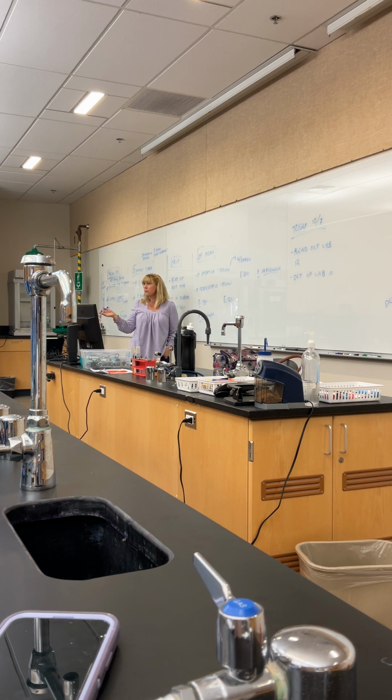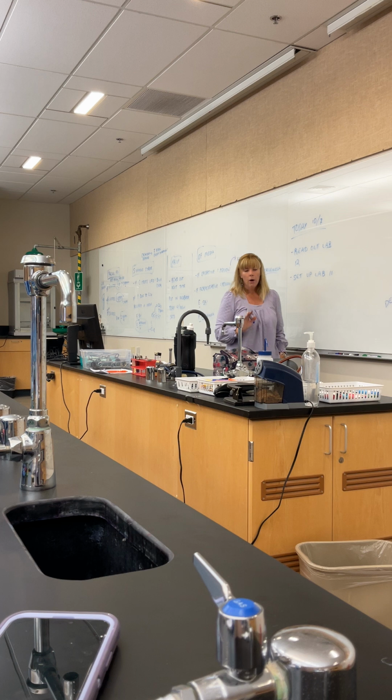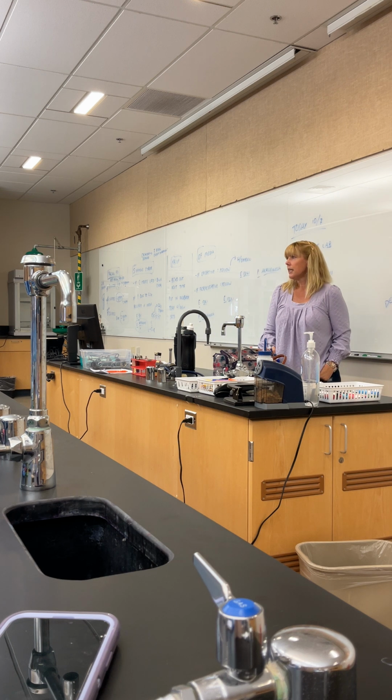And that makes sense. Where does E. coli live in our bodies? In our guts. Are our guts aerobic or anaerobic? Anaerobic. Yeah, I hope so. Yeah, they're anaerobic, okay? If we got air bubbles in there, we're not going to be feeling good, all right? So E. coli survives in our bodies, and then if we put E. coli on a plate, he lives in our incubator, so he can survive either way, all right? So E. coli can go either way because he's a facultative anaerobe. Okay, does that make sense?